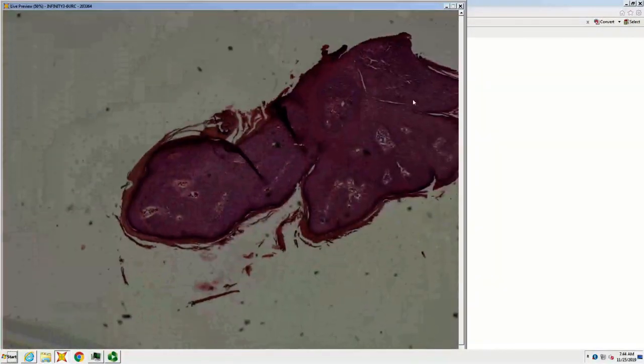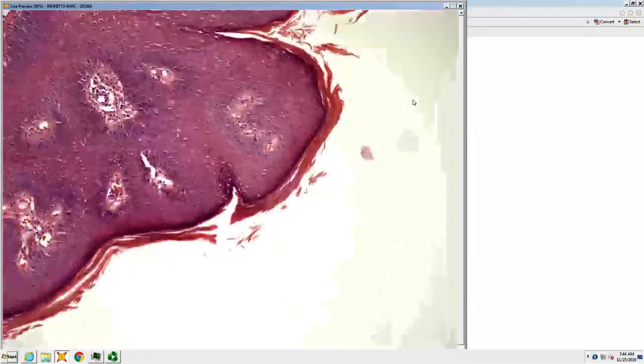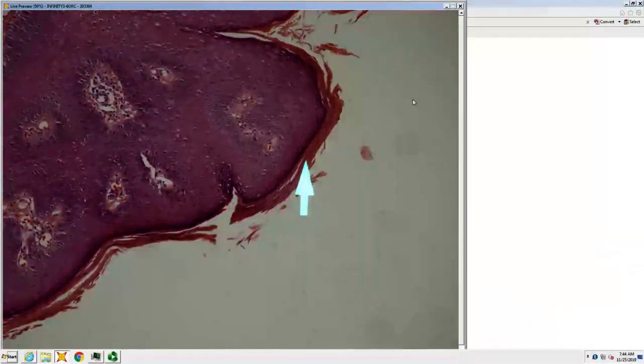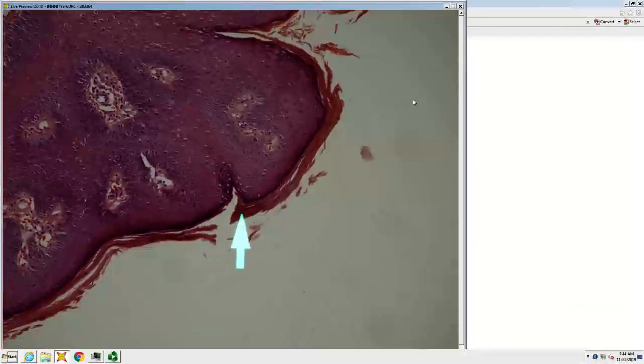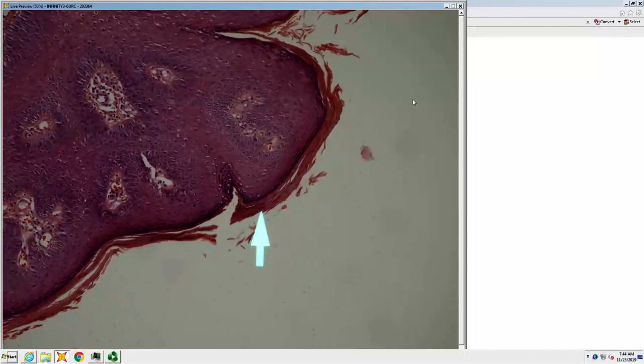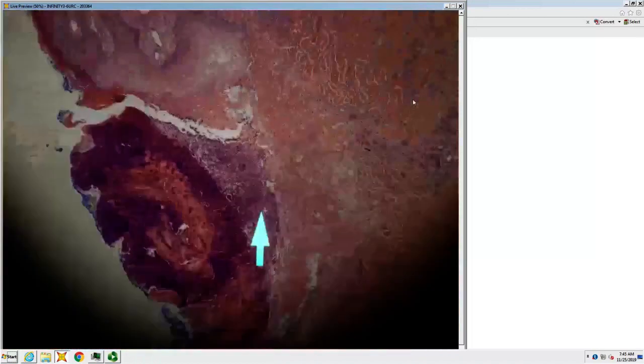It's like a little seb wart or condyloma. Okay, so is it seb wart or condyloma? This one's probably condyloma. It doesn't have the basket weave corneum or the loose lamellar corneum of a seb wart, so in this case, probably condyloma. In the United States, given the prevalence of condyloma, pretty safe bet.